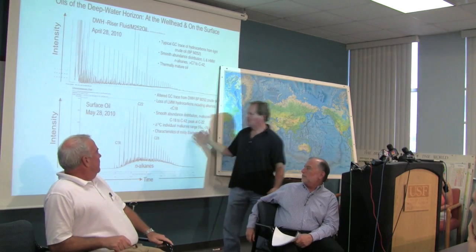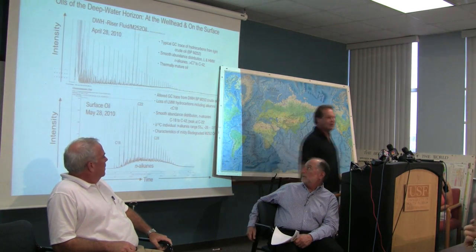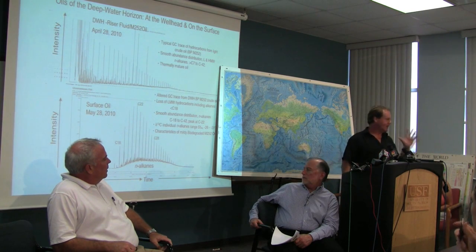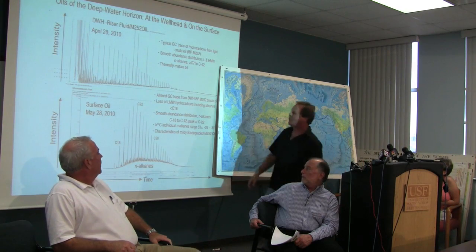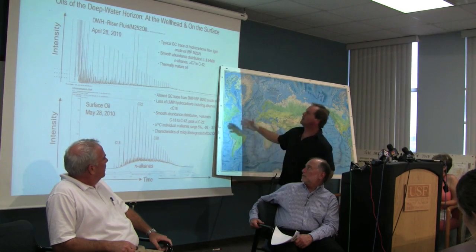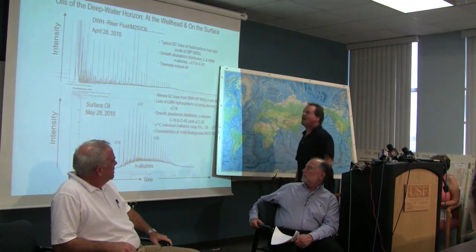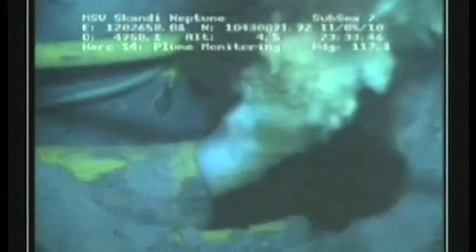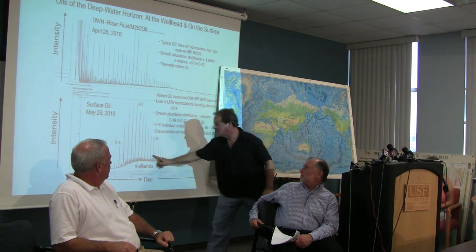And interestingly, this is the oil that you see on the surface. So it's gone through some sort of transformation, so it's not immediately apparent, or it's not that easy, to tie one to the other simply based on some of the general characteristics. But what one does see is, indeed, the classic example of what they call the M252 oil from the Deepwater Horizon.